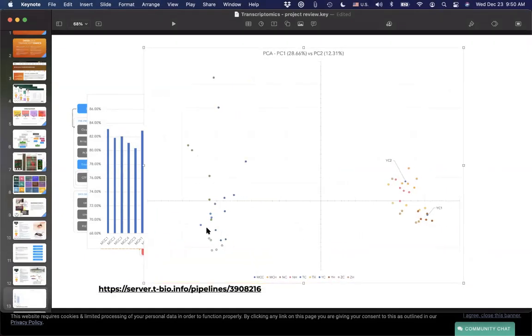And then finally, as mentioned already from the PCA analysis, we can see that just taking this data and looking at it from a principal component analysis perspective, we do see some interesting control samples over here in the heat shock group. So what was your conclusion about that? The conclusion is that the control samples are at a comfortable temperature. They're at about 17 Celsius, which is pretty optimal for them, versus the others that are really uncomfortably heated up, 10 degrees more.